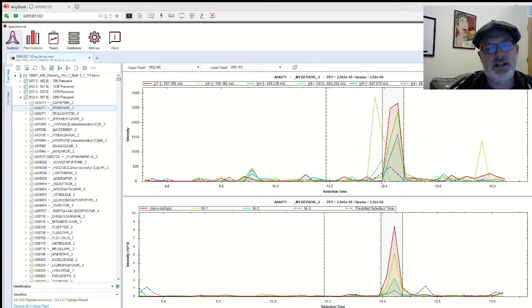Okay, so you can look at other precursor ranges like this one. Ooh, that looks pretty. You can see the retention time. It looks a little bit far off, but we're still zoomed in. So it's predicting it to be 10 minutes. And because this is analytical software, it's 100th of a second. So 10.2 versus 10.4. So that's not bad.